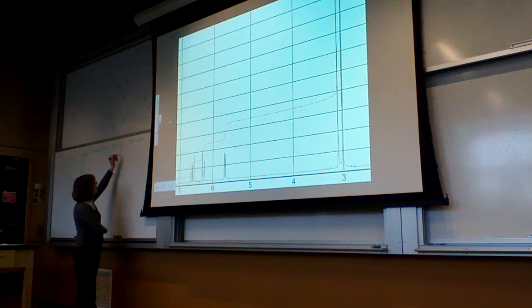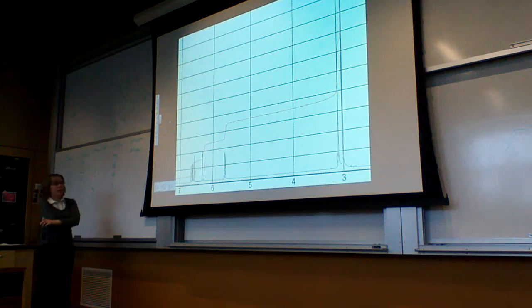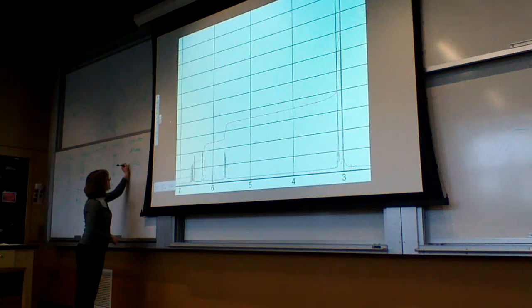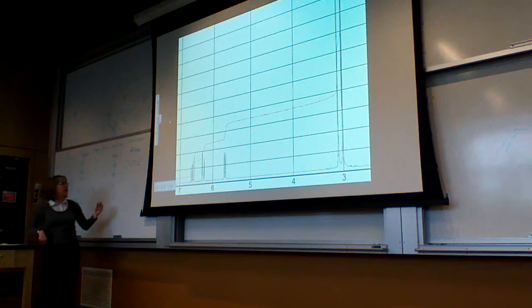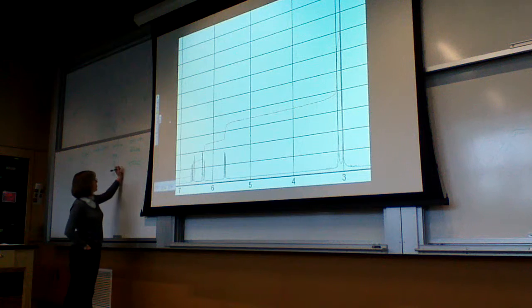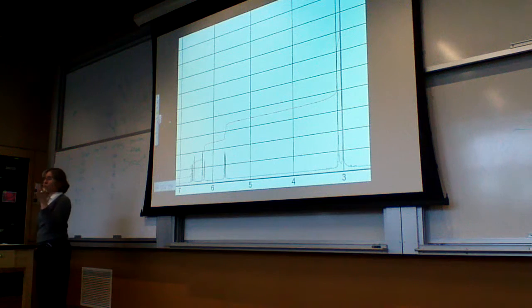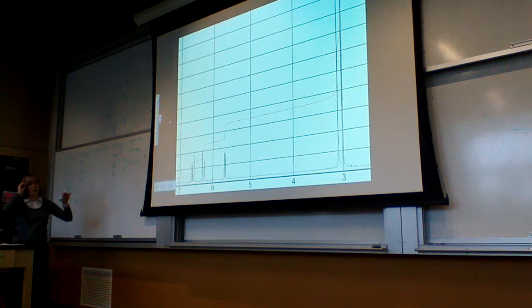So all of these are in the alkene region, and there are 3 of them. If you look at a standard alkene, there are 2 carbons with spots, or 4 total things to be attached to the alkene. In this case, we have 2 hydrogens on 1 carbon and another one. Now, another assumption you would not want to draw is that just because there's 3 in this region, there's just 1 double bond. It could be that there's 2 different double bonds, one with 2 hydrogens and one with 1. You would have to know from the molecular formula whether that's a possibility or not.